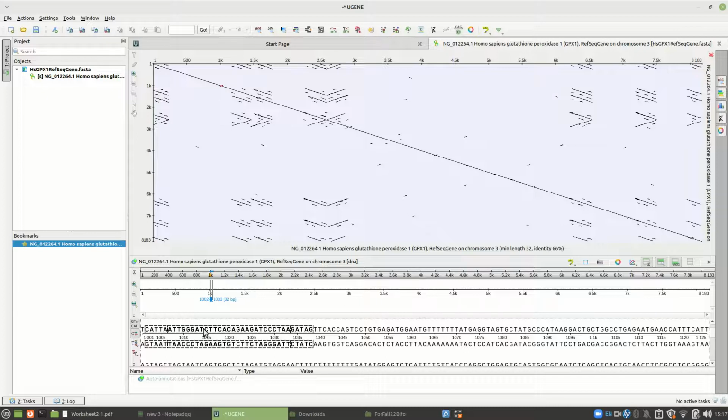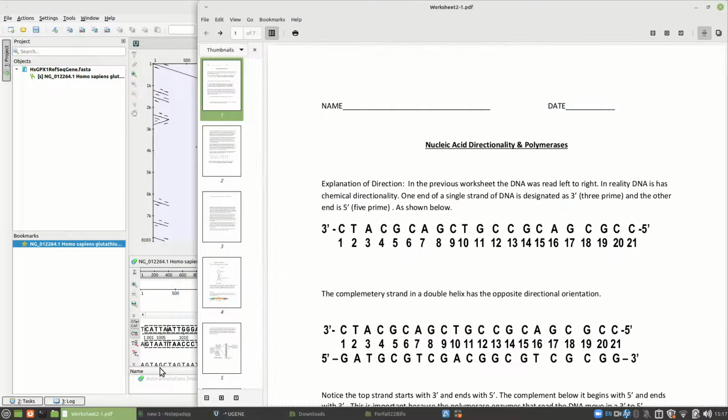I like that piece they were just showing us. Several T's. Where was that? Right in here. It's a TTAATT or an AATTAA. Actually, it's a TAAT. I'm thinking that's a good place for a TATA box right there. So I'm going to make a note of that.